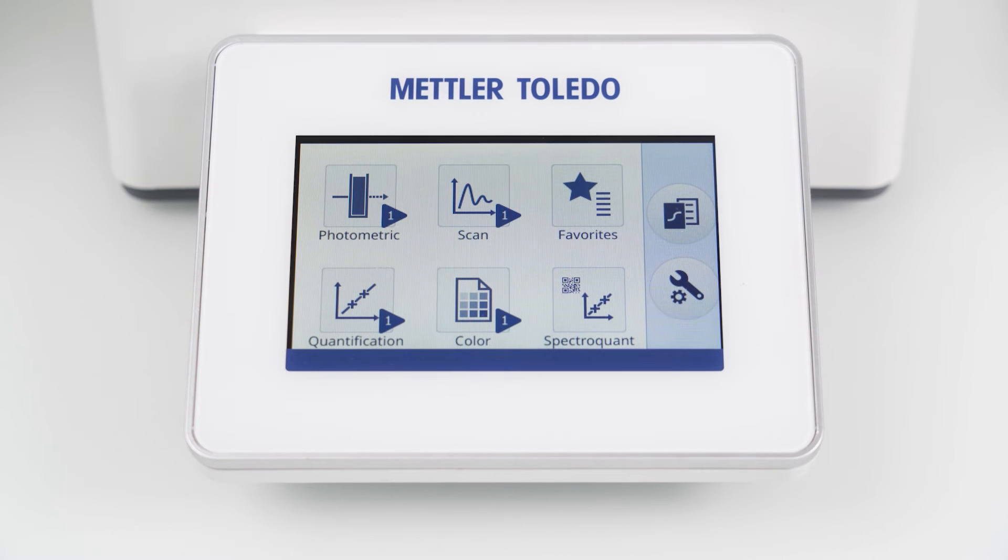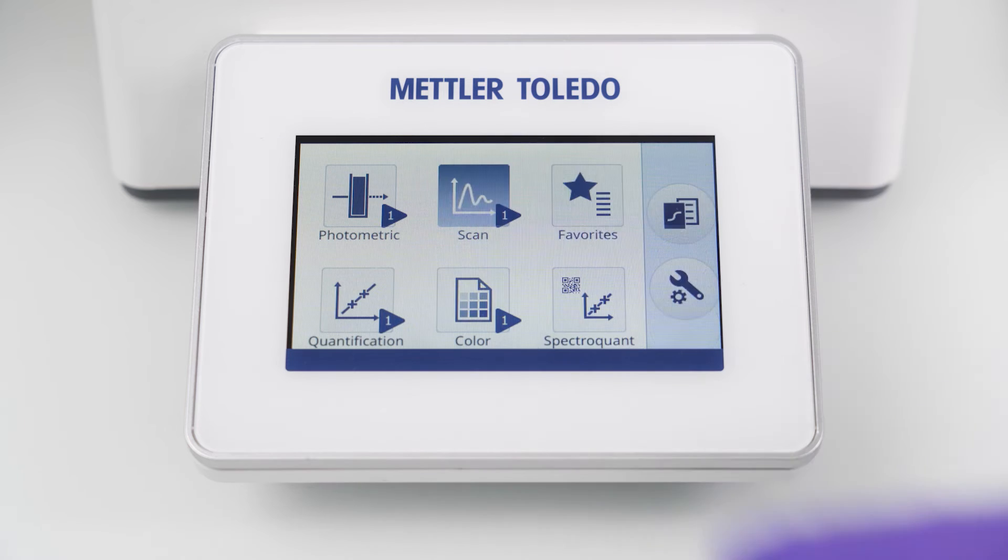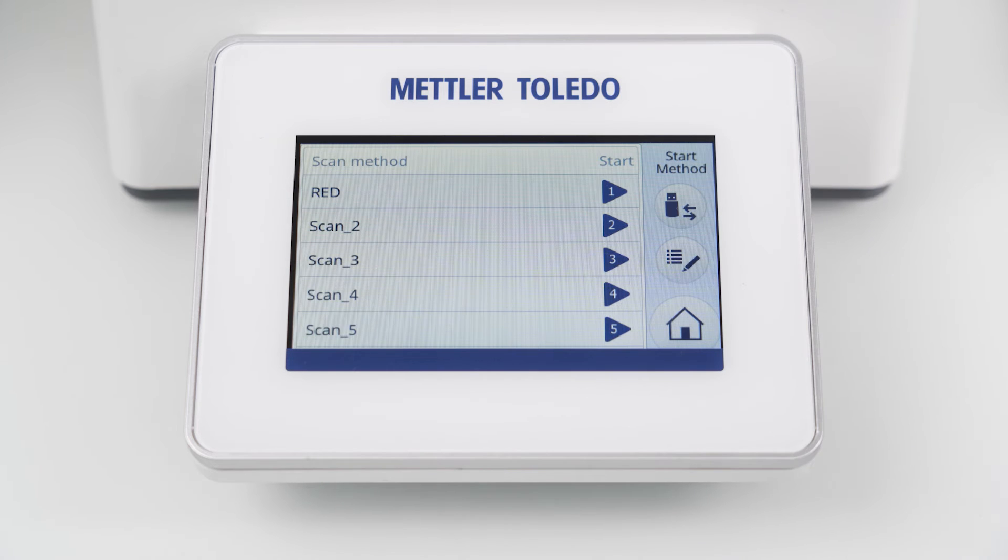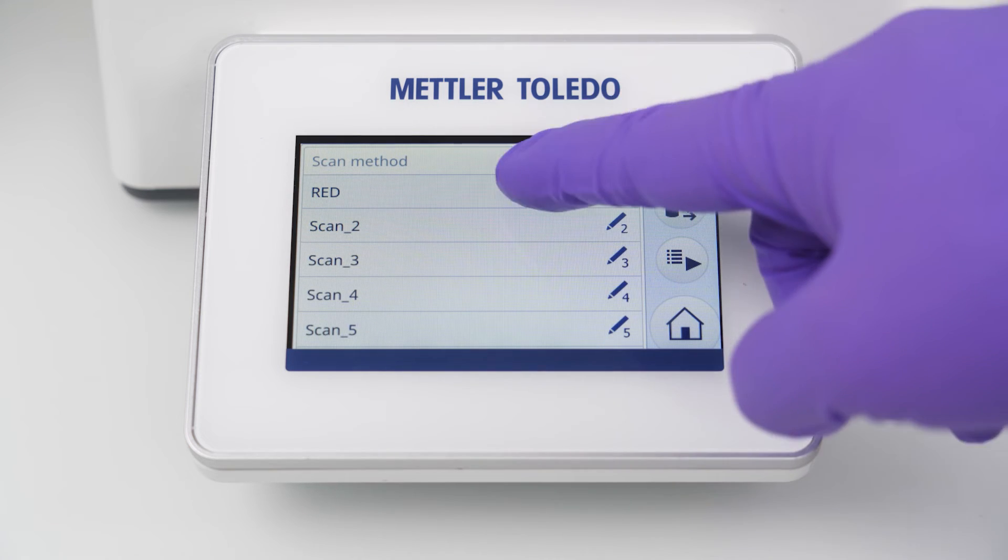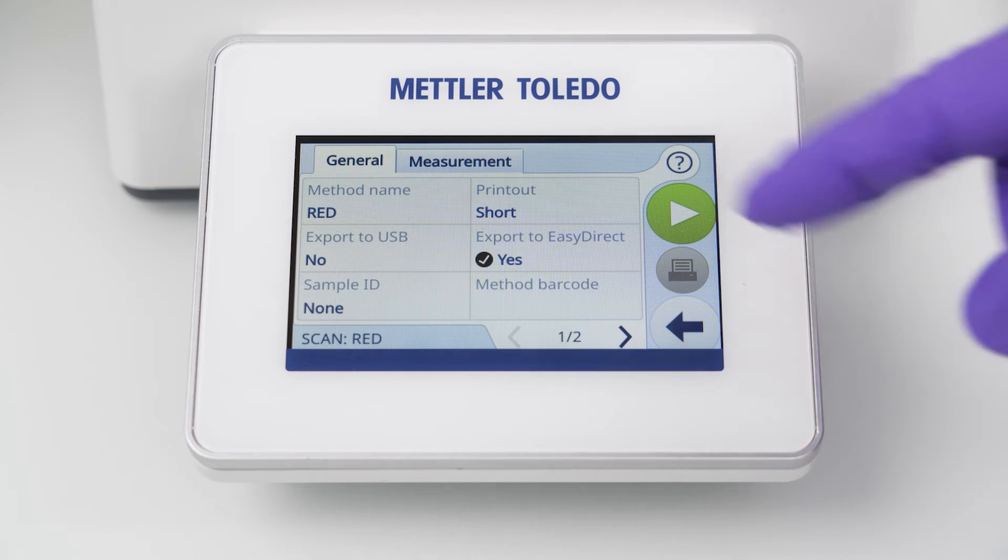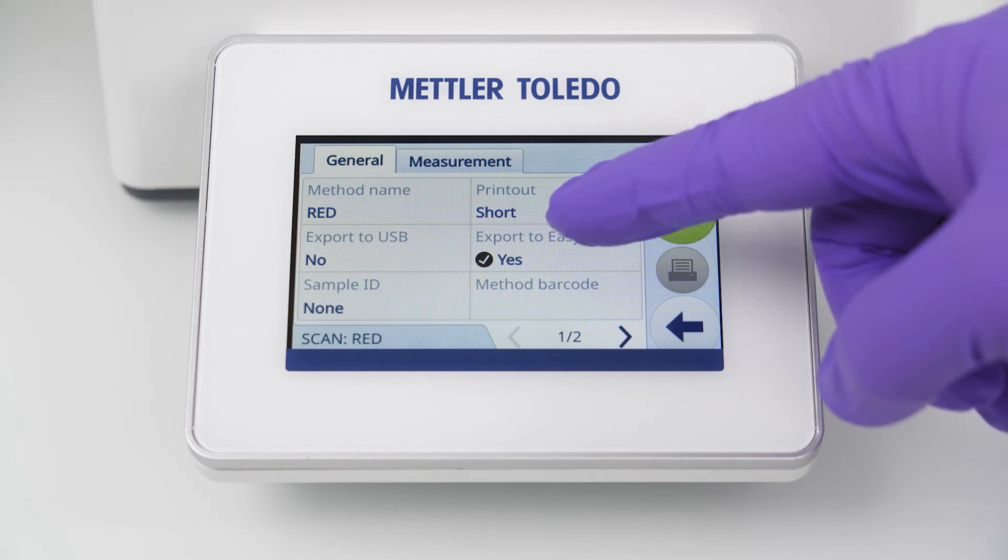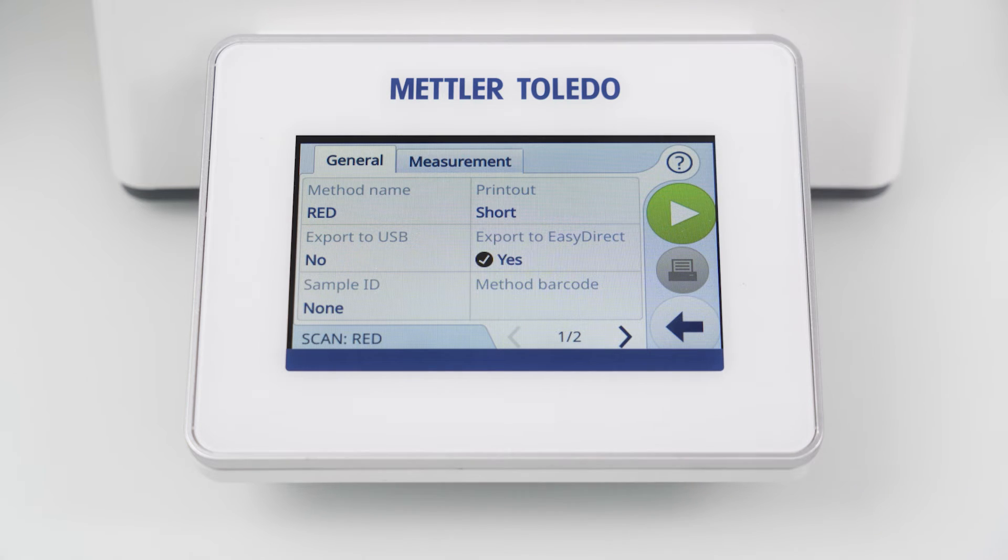After establishing the connection you have to activate the parameter export to EZ Direct in your method on the instrument. This parameter can be found in all categories in the general tab. Per default the export is enabled.